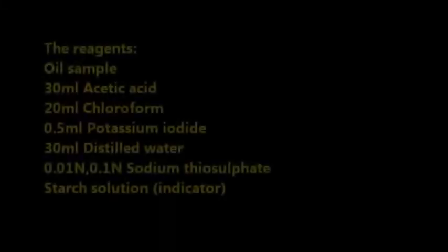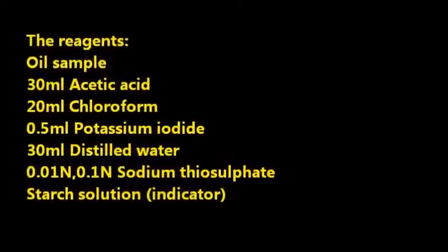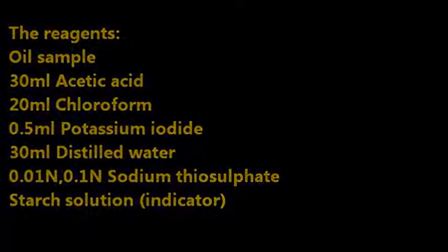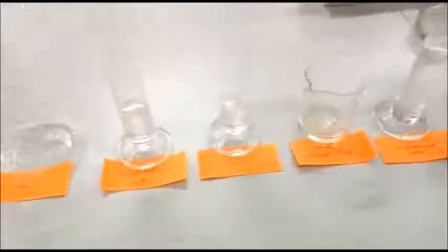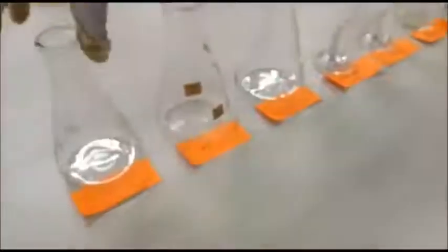The reagents for these experiments are oil sample, acetic acid, chloroform, potassium iodide, distilled water, sodium thiosulfate, and starch. The procedure. These are the apparatus and reagents needed. Firstly, glacial acetic acid, chloroform, KI, distilled water, and sodium thiosulfate.